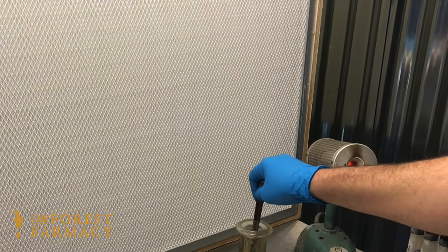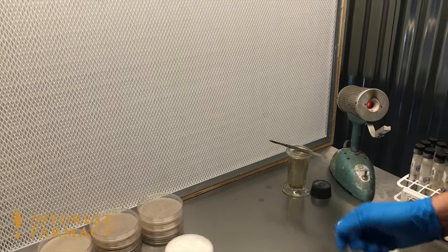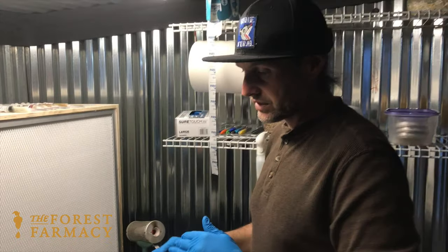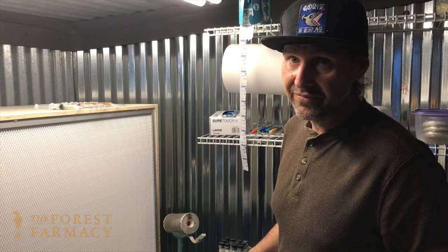Got a little bit red — usually about 10 seconds in there is good. We do a lot of classes and we teach people sterile lab techniques. If you want to learn how to do this, check us out. Thank you.